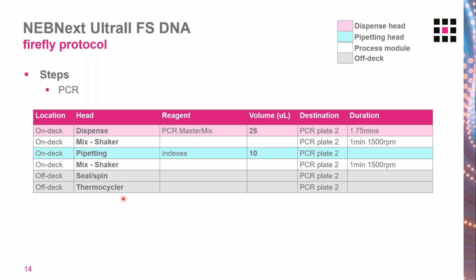We push a strip tube into the foil seals of the index plate to pierce them and to really open out those holes. The holes are then sufficiently wide that when we're using our pipetting head to aspirate from the index plate, we don't have any problems with the transfer. The plate's not picked up, and we don't need to hold that index plate down.